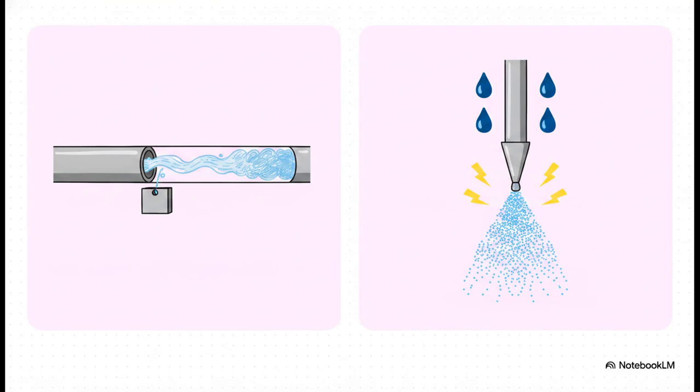Let's look at how the two heavyweights of chromatography actually pull off this direct interface with the vacuum. With gas chromatography mass spectrometry, or GCMS, it's pretty straightforward. The gas stream emerging from the chromatograph is simply admitted through a valve into a tube where it passes right over a molecular leak. Easy enough.